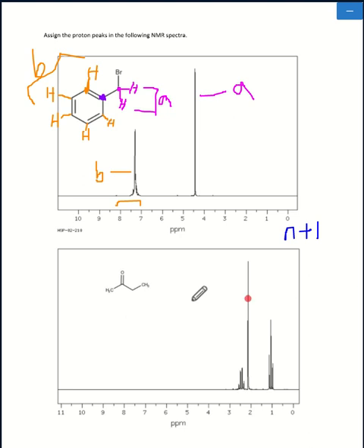So let's start filling out the various hydrogen in this molecule. This molecule right here, the bottom molecule, the rightmost carbon, is a methyl group. So essentially this is a CH3. I'm just going to spell out those 3 hydrogen right there, just because it's small on this screen.